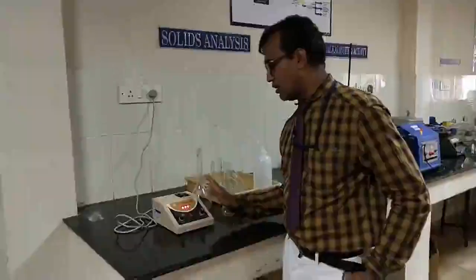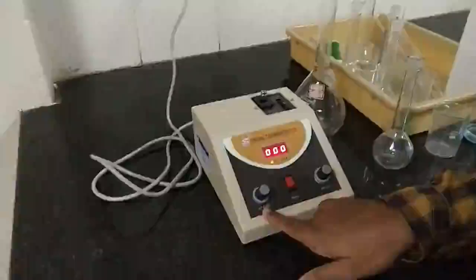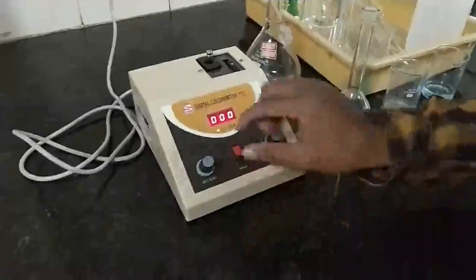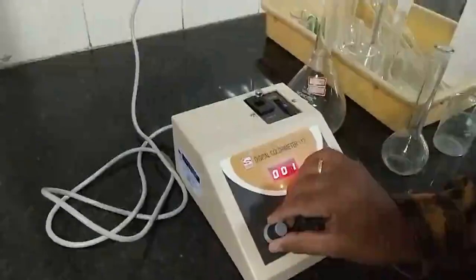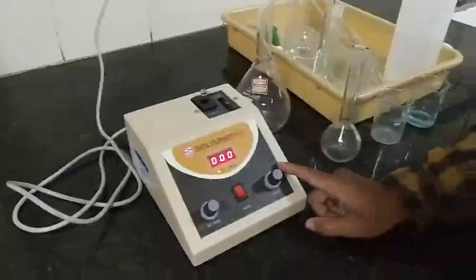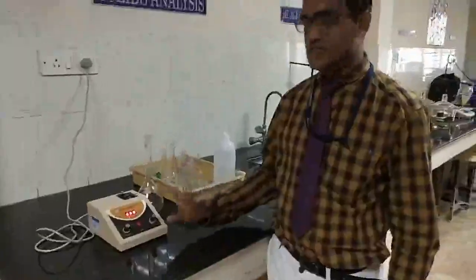you have to calibrate the digital colorimeter. For that we are measuring the transmittance. Here set 0 is there and then set 100 is there. First you have to fix the set 0 by rotating the knob and making it 0. Like that you have to make it 100% transmission. That is what we have to do before conducting the experiment.